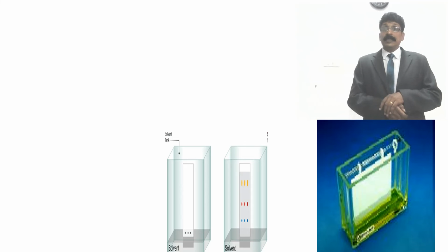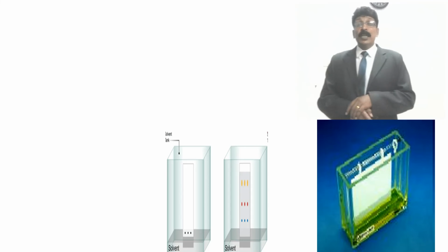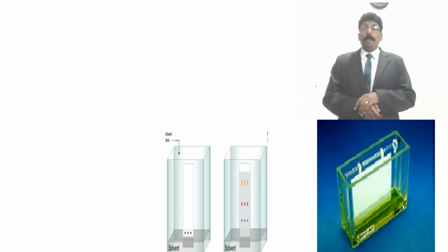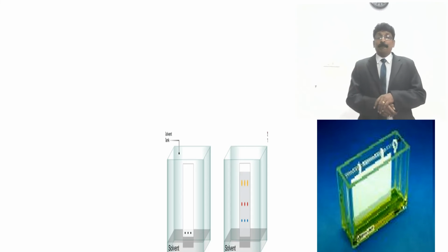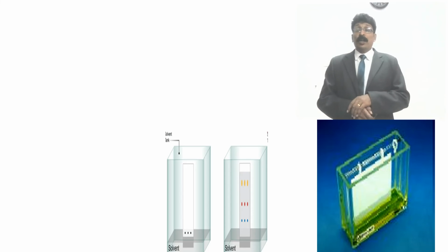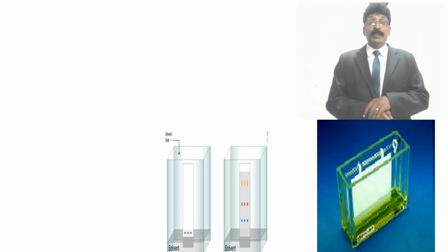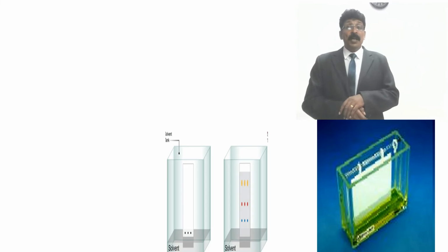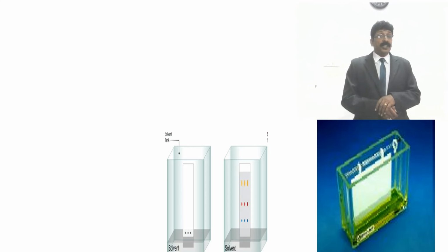Saturation of the mobile solvent in the chamber is very, very important for you to get the movement of the spot and the separation of the spot, and for the development of the chromatogram. That is also something we have discussed in the class: why we need the saturation of the vapor in the chamber.